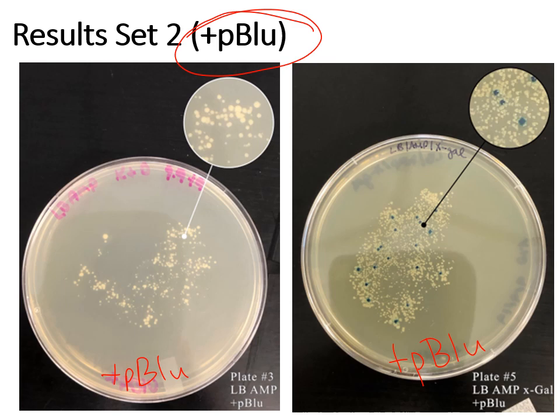Okay, so if you're asked about the LB plate for plus P blue, it is in result set 1, even though I'll talk about it as if it's result set 2. I want you to notice, it's a little blurry, but this plate on the left, this is the LB amp plate, whereas this plate on the right, this is amp and XGAL.